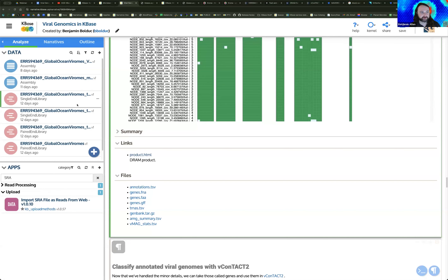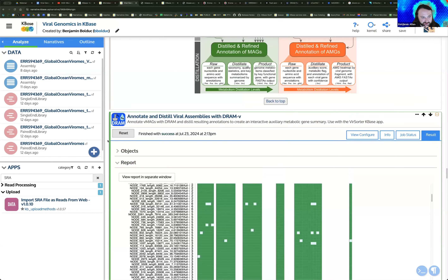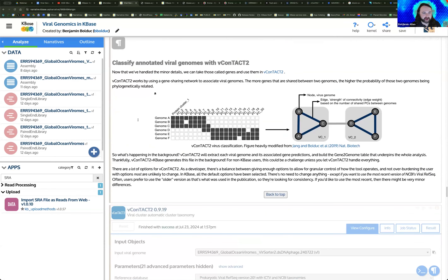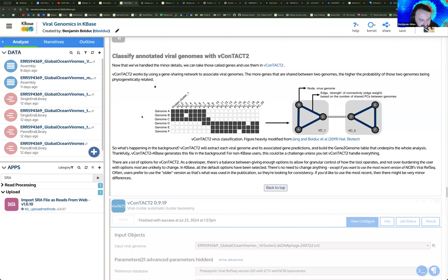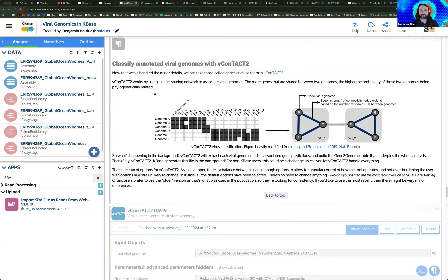Moving on from DRAM-V, let's take a look at V-Contact2. We did a little bit of taxonomic classification with Kaiju, but Kaiju is meant to give you a broad overview of potential taxonomy within your sample. V-Contact2 allows you to get more granular with your viral taxonomic assignments.